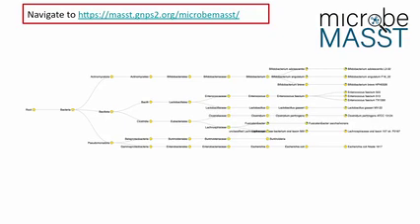So if you're querying a drug molecule or a drug metabolite and you find it here, maybe that doesn't make sense, because why would this drug suddenly show up in this infrastructure? So just be careful on how you interpret spectral matching, and whether it makes sense or not.